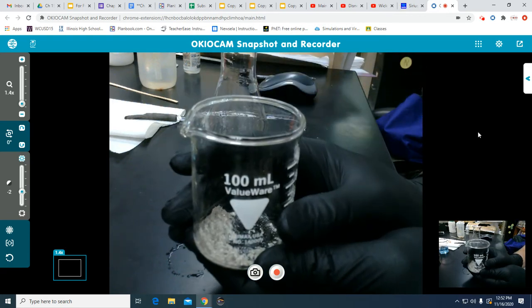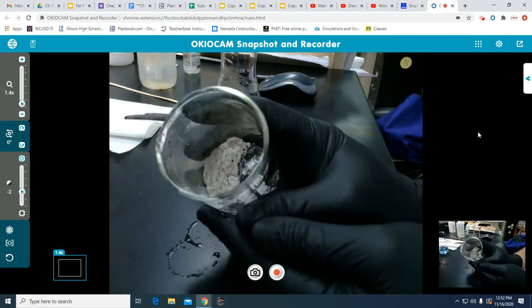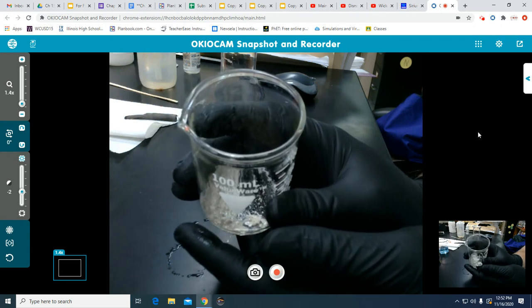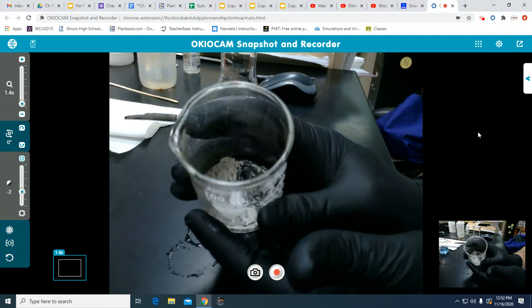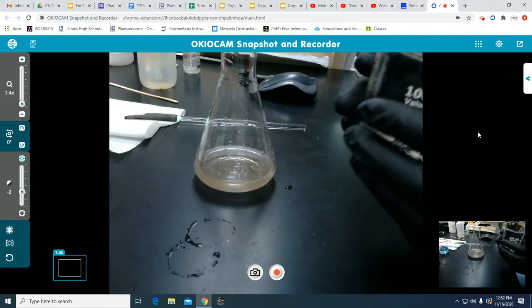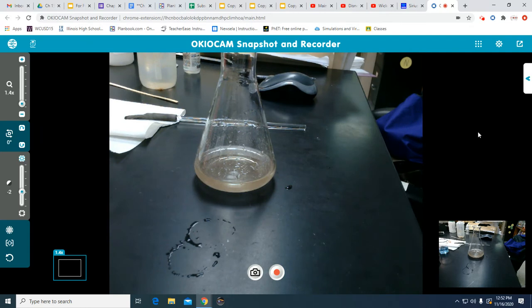So it may be longer than 24 hours. You want to make sure you get all the water out of there because you don't want any of the water interfering with your final mass. And once this whole thing's done, this is going to go in my retirement fund, remember? All right, so I'm just going to place this over here under the fume hood.